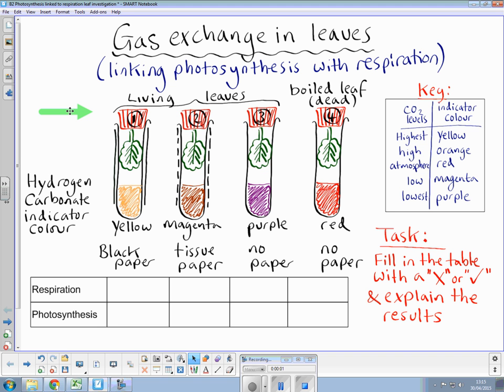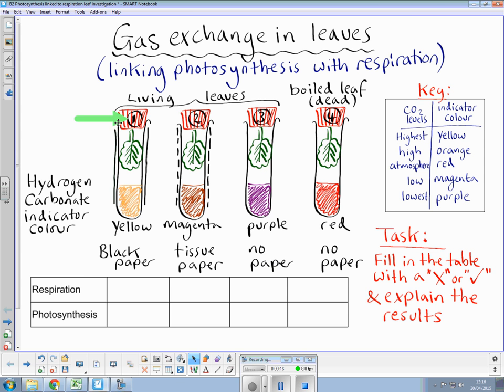Here we have a classic investigation linking photosynthesis with respiration. As you can see, we have four boiling tubes. Each have a leaf inside, and they have been stoppered with a bung, as you can see here, and the numbers are all along the top.